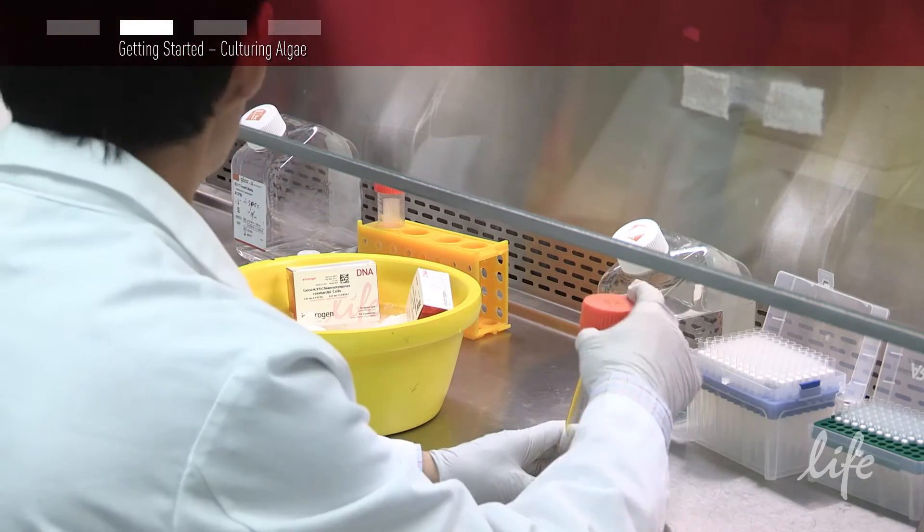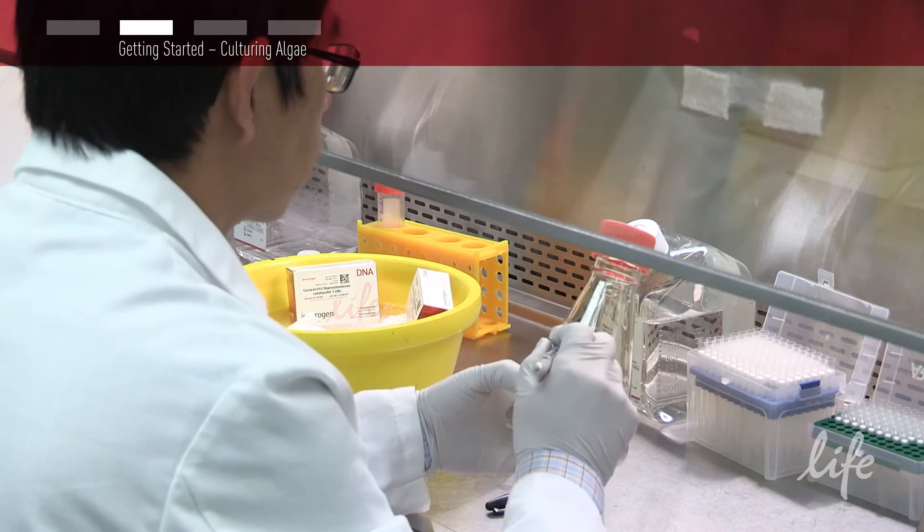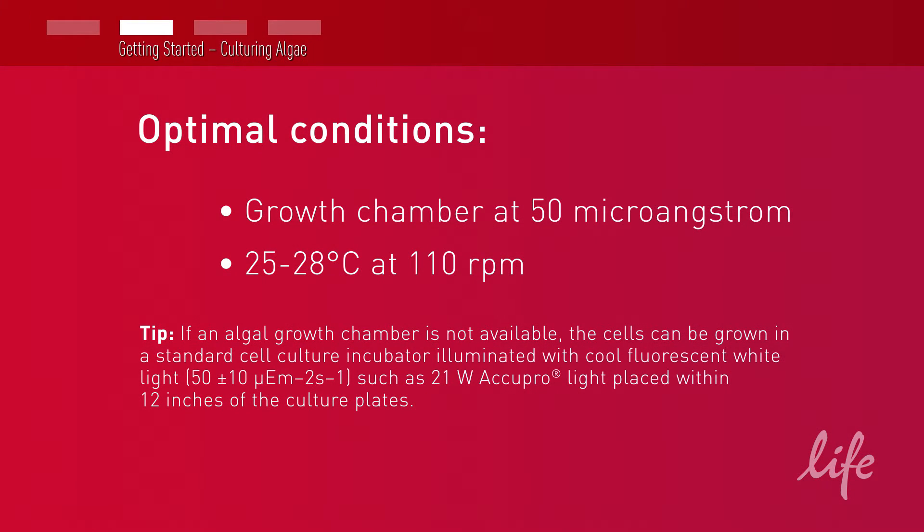To gain the required 1 to 2 million cells per ml, you need to grow the culture for 3 days. The optimal conditions are in a growth chamber at 50 microeinsteins, 25 to 28 degrees Celsius at 110 RPM, without the presence of increased carbon dioxide, as this can make the cell walls rigid and inhibit transformation.